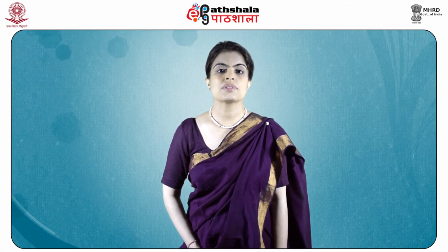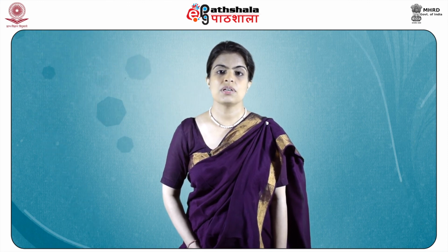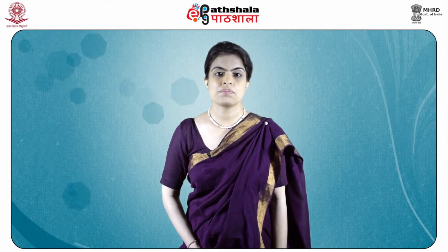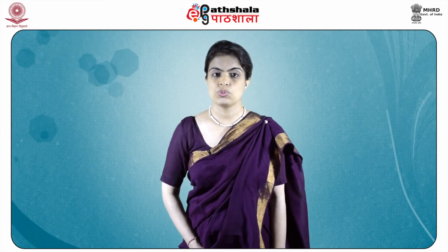Ion exchange columns separate molecules on the basis of their net charge. For a given ion exchange column, binding affinity for a particular analyte depends on its net charge under the conditions of pH and ionic strength of the buffer system being used. Choice of an ion exchanger for protein molecules depends upon their stability at the pH being used.